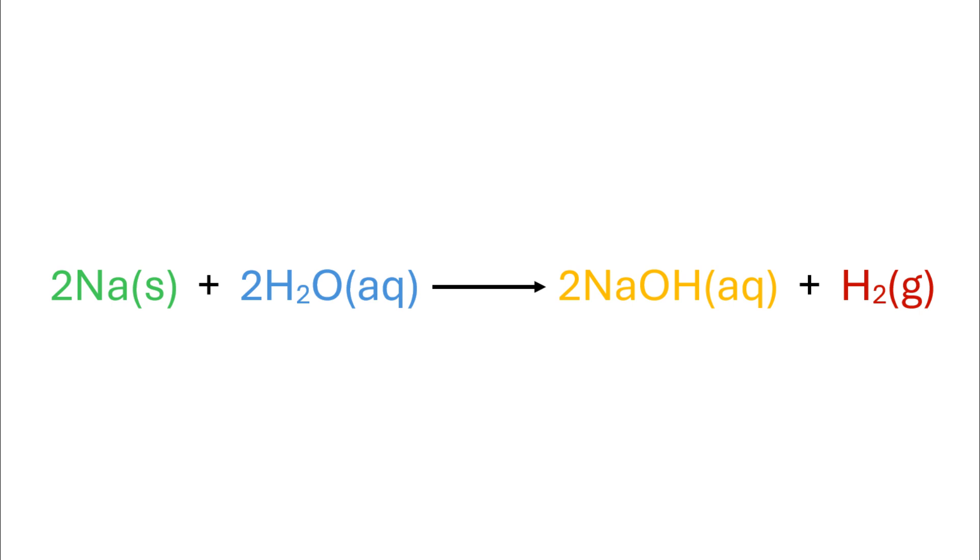In this reaction, the more reactive sodium metal displaces the less reactive hydrogen from water molecules to form its hydroxide. The free hydrogen atoms combine among themselves to produce molecular hydrogen, which is released in the form of hydrogen gas.